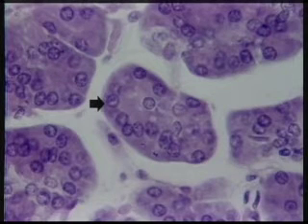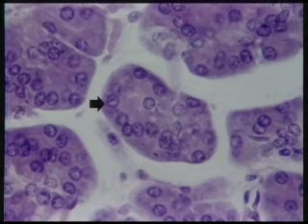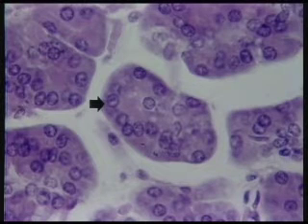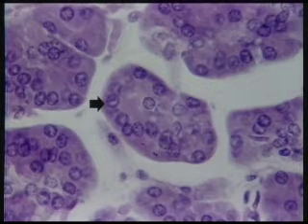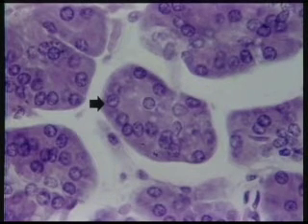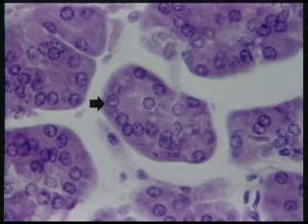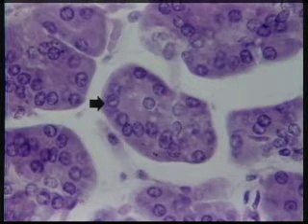Well, we've just looked at the nucleus and chromosomes, and now we're going to concentrate on the cytoplasm, and to do that we're returning to the pancreatic acinar cells, which we're a little bit familiar with now. The arrow indicates a ball of these acinar cells, but these are stained with a different stain. Beforehand, we were looking at pancreatic acinar cells stained with a stain called toluidine blue. Now we're looking at pancreatic acinar cells stained with hematoxylin and eosin. This particular stain, which is usually called H&E, is the most common stain used for light microscopy.